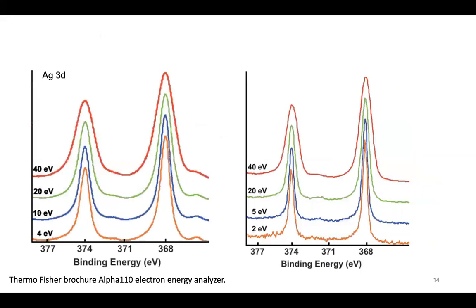And so for the silver 3d, you can see here that you can get this higher resolution with a detector that has better analyzers, and you can get the full width at half maxima to be more well resolved, and you can run some really nice scans that you see here.